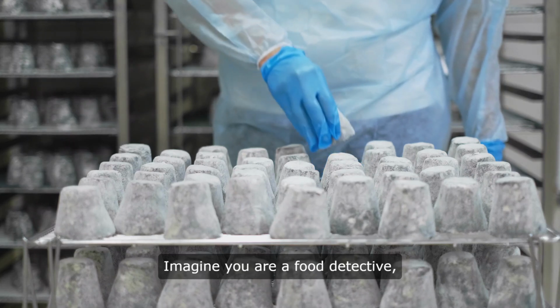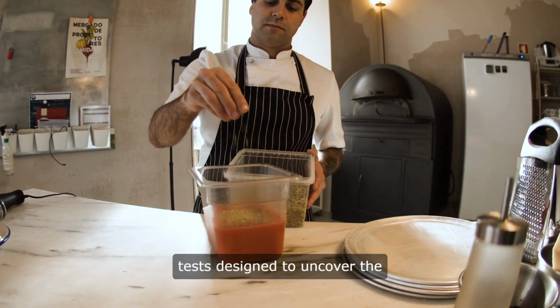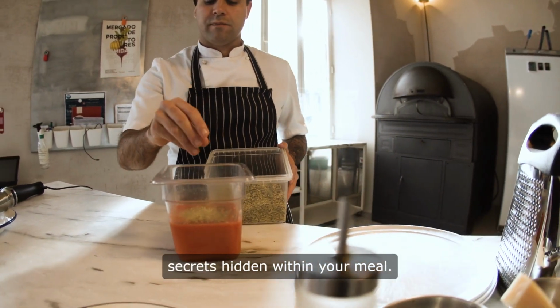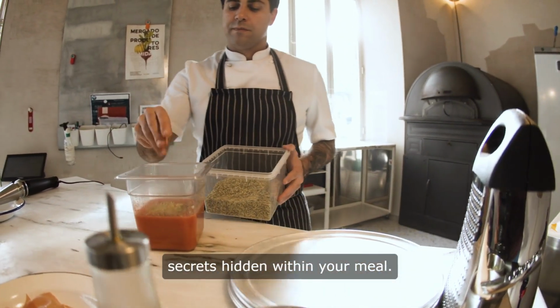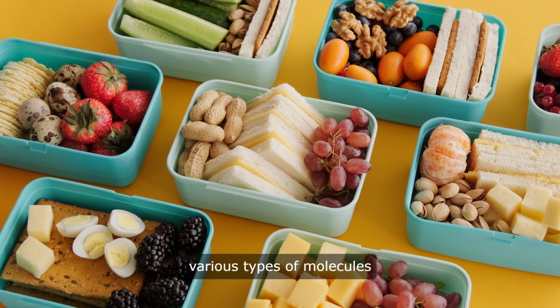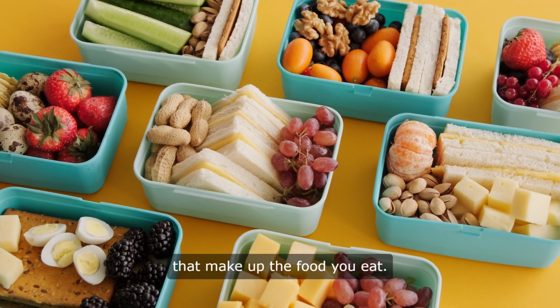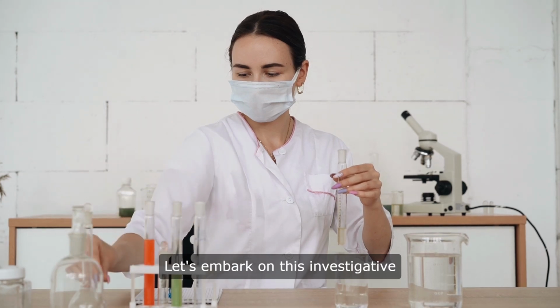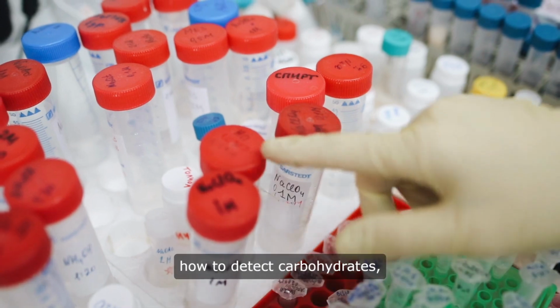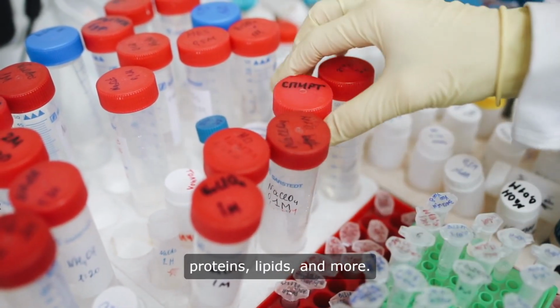Imagine you are a food detective, equipped with an array of tests designed to uncover the secrets hidden within your meal. By using simple yet clever biochemical methods, you can identify the various types of molecules that make up the food you eat. Let's embark on this investigative journey and learn how to detect carbohydrates, proteins, lipids, and more.